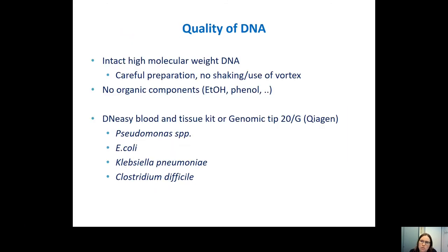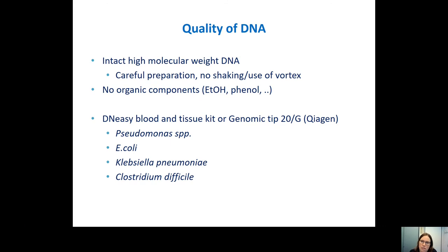When you start using nanopore sequencing, you have to pay attention to DNA quality. You want to have high intact, high molecular weight DNA. What you put in the sequencer is what you get out — so if you break the pieces of DNA, you will also get small pieces. Be careful with preparation: don't shake or vortex too much. Also, because the pores are biological molecules, you don't want any organic components in your run as these will disturb and damage the pores — no ethanol or phenol in your sample.